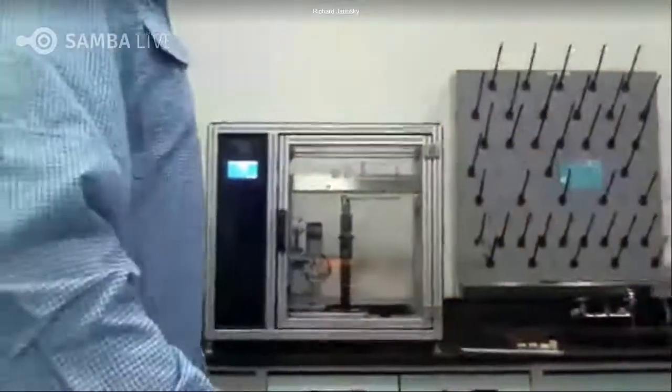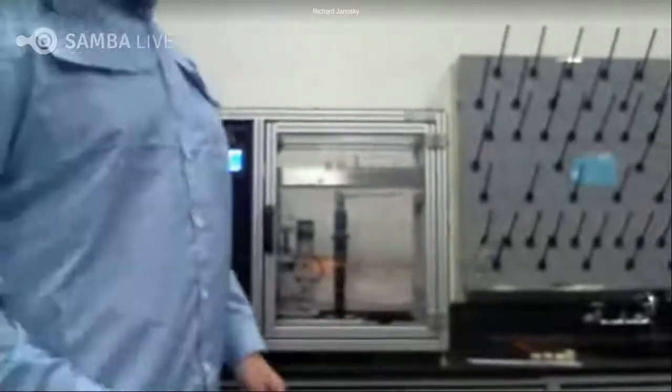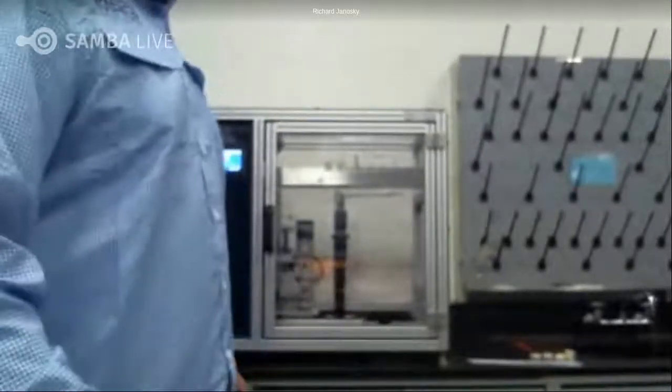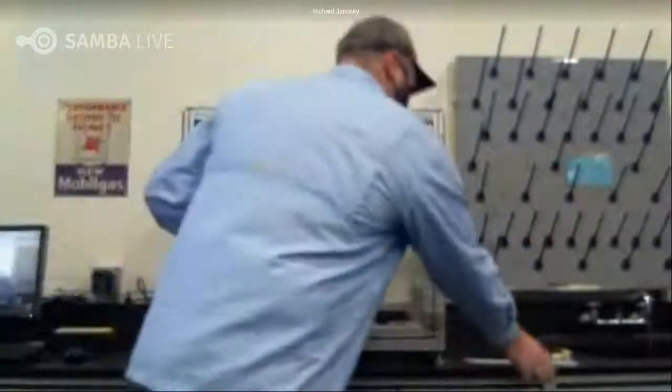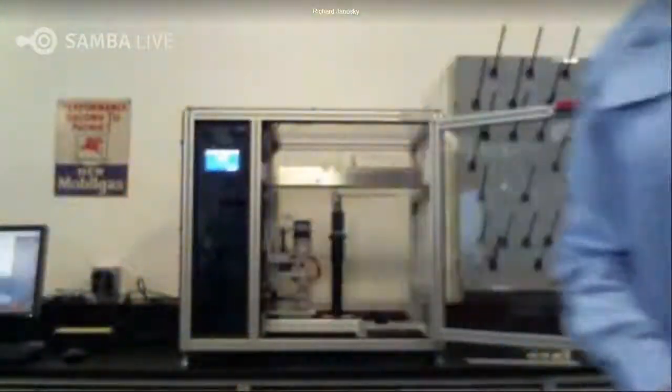And then next I'll have a sample that I've already prepared, and I'm going to get ready to run that for you and show you the extrusion method. We talked about the substrate. So I'm going to move you closer so you can see what I'm doing.